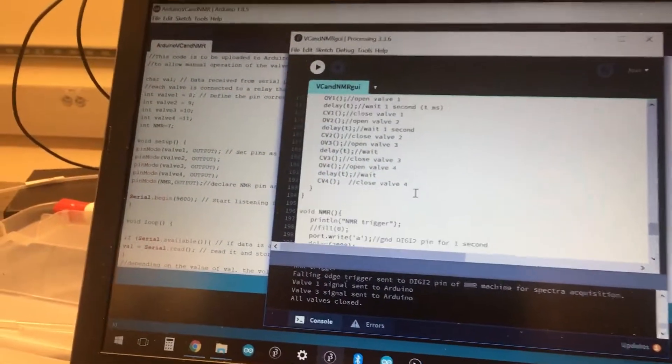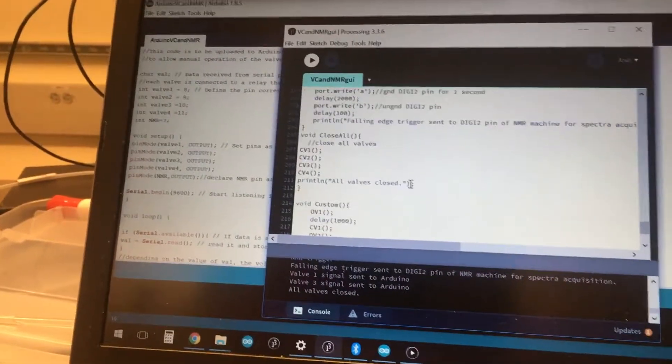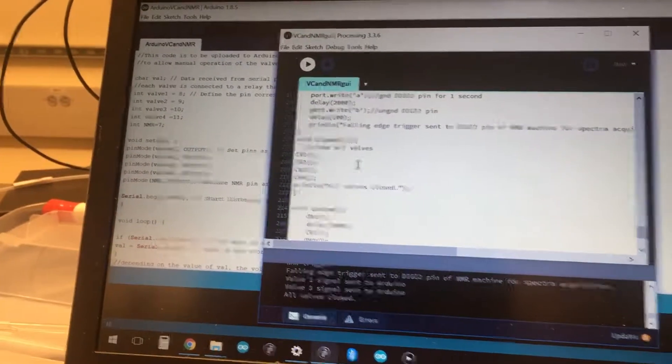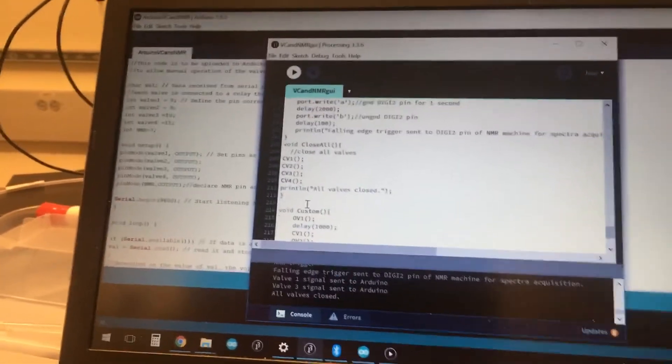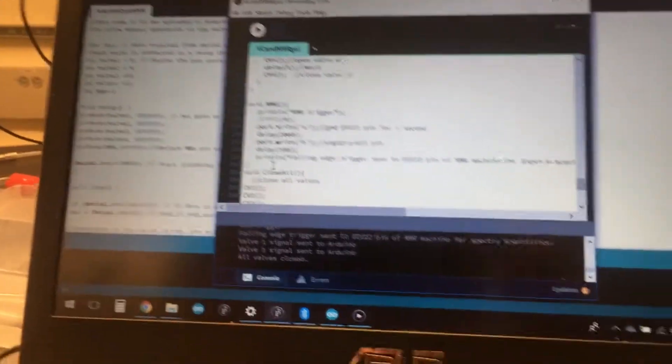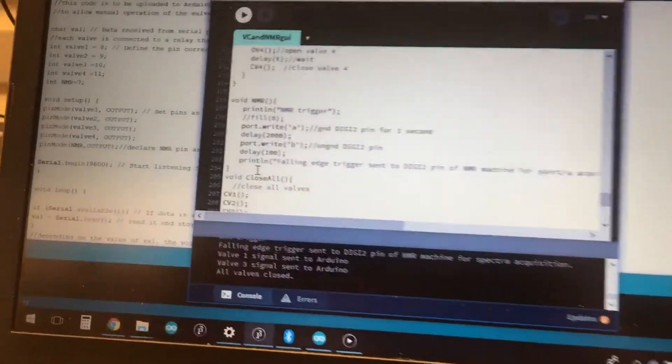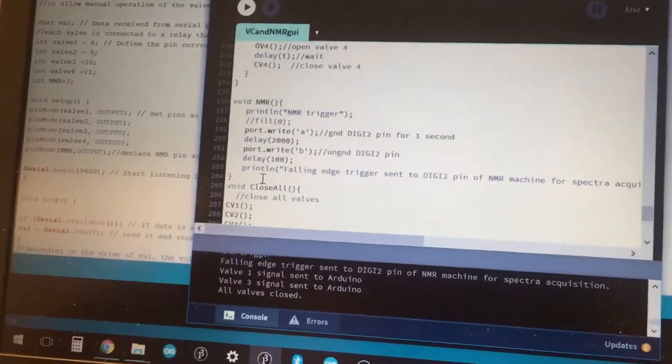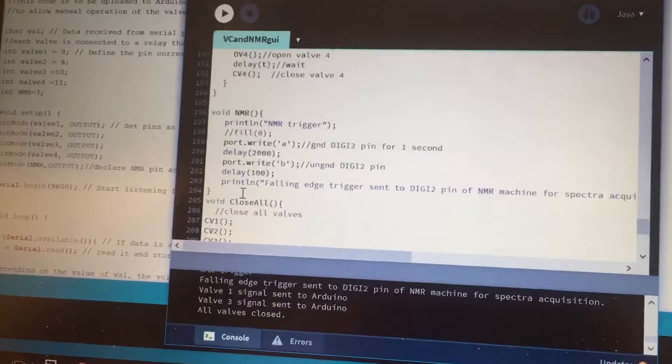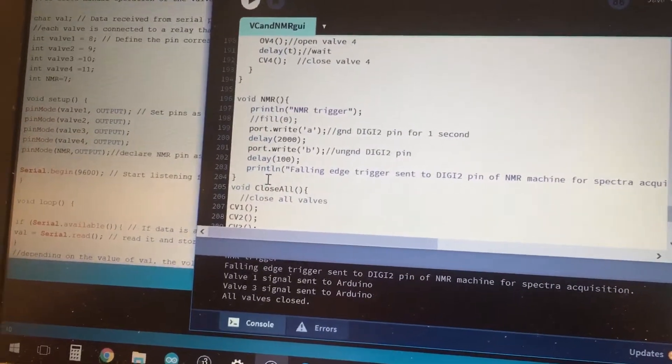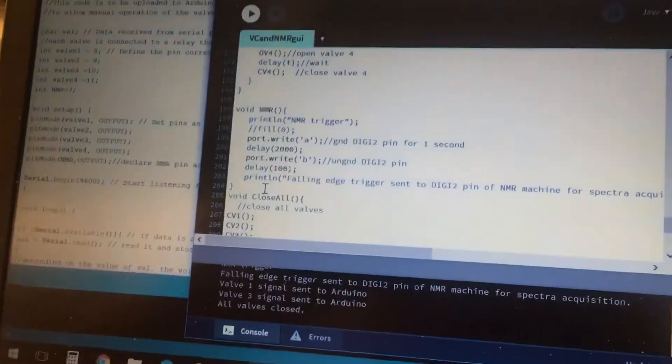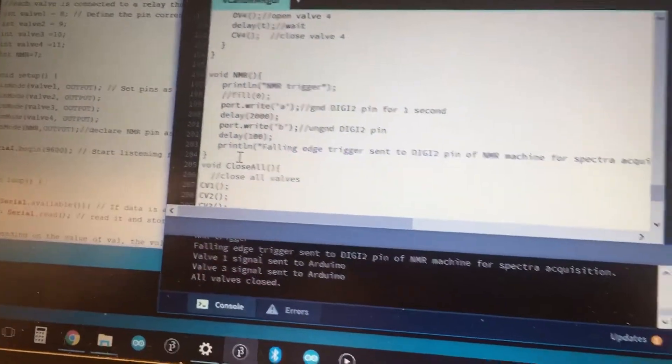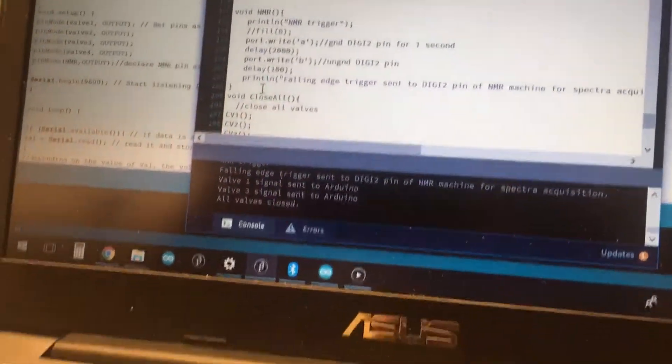In the custom area, we're able to define whatever we want with particular scripts. Finally, the NMR trigger is a matter of sending an appropriate signal over the serial port, which will cause the Digi 2 pin, which is a pin on the NMR machine itself, to be grounded on a logical voltage difference, and this causes the falling edge trigger to be sent.